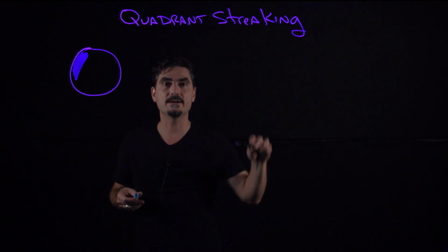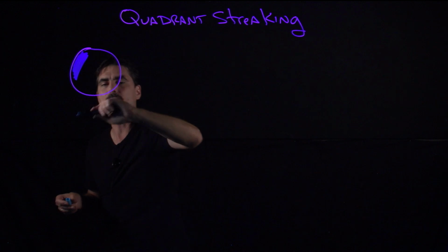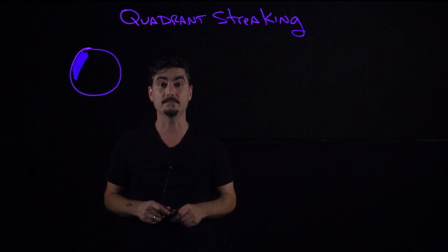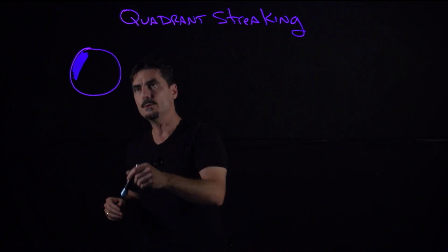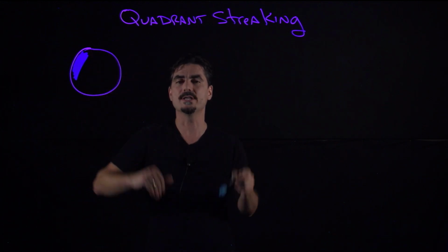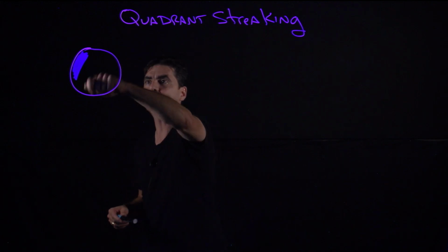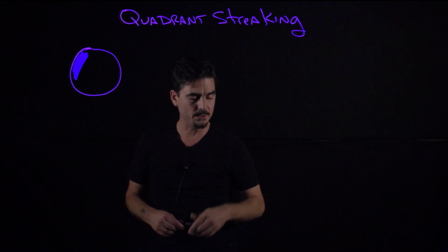Other times we may be taking it from a broth or from a plate, but still, in the first quadrant, we always put a lot down and smear it all around to try to get it relatively evenly distributed in that quadrant 1, okay? And then, for example, if you're using a loop, then you would sterilize that loop. In between every quadrant, sterilize your loop. In the first lab, Ubiquity of microorganisms, we do a swab for the first one. But still, before you ever use a loop, you need to sterilize it.